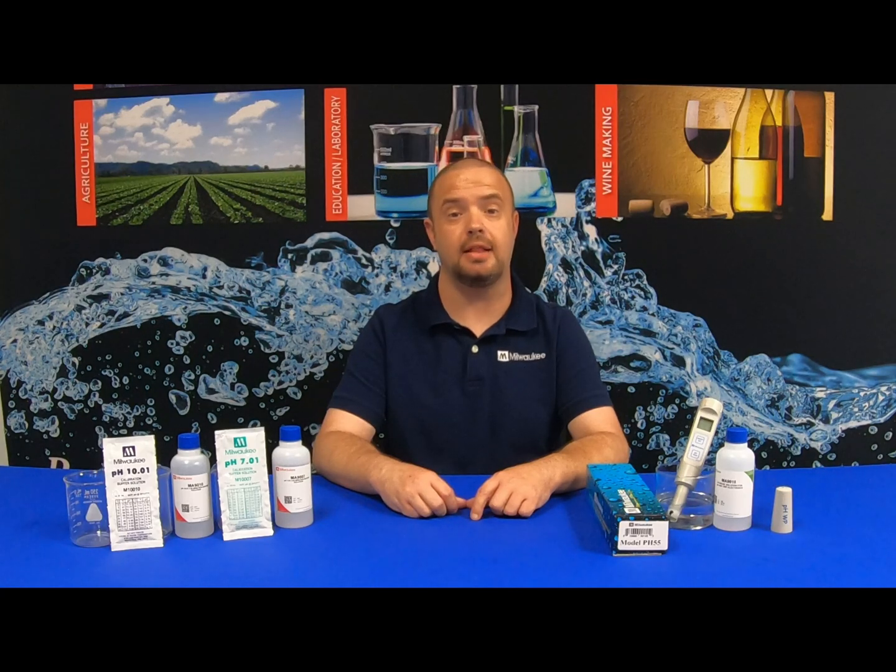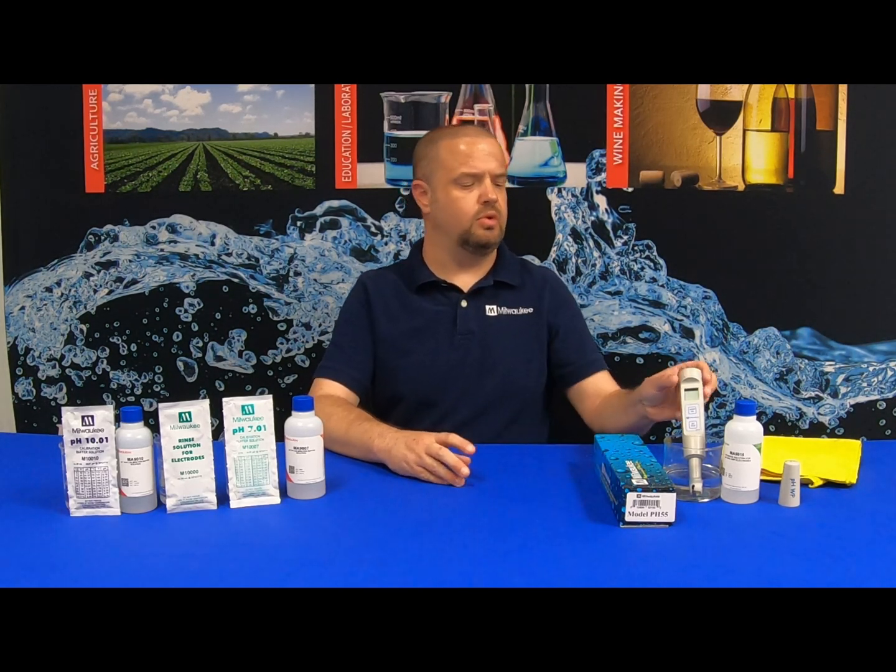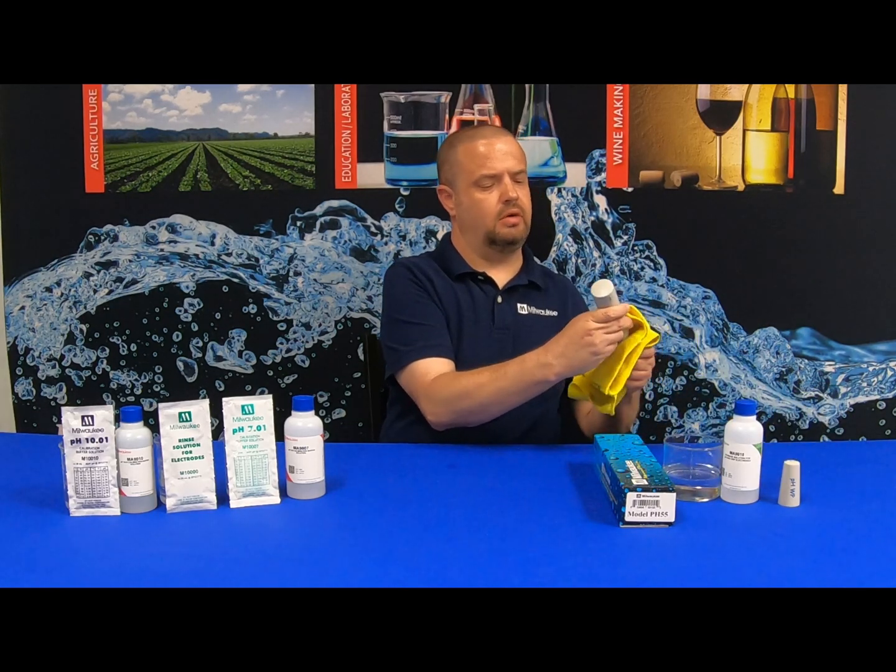To begin, as stated in previous videos, you want to be sure to condition and hydrate your probe for a minimum of two hours in Milwaukee Instruments MA-9015 storage solution prior to calibration. Once you have allowed the allotted time for your probe to hydrate and condition, you can then remove it from the storage solution and dry it off.